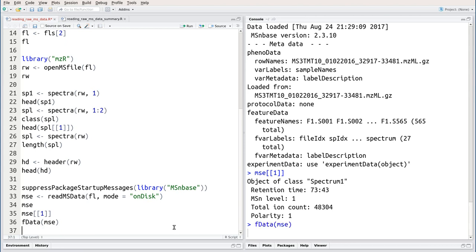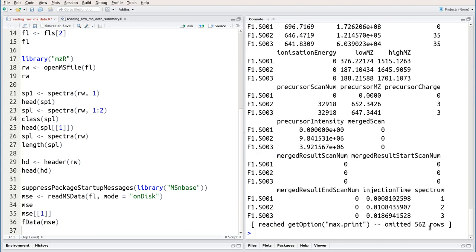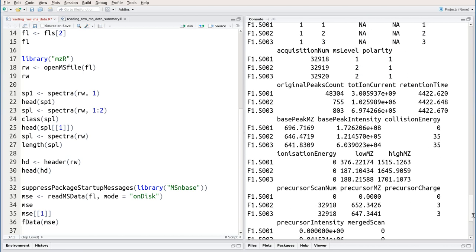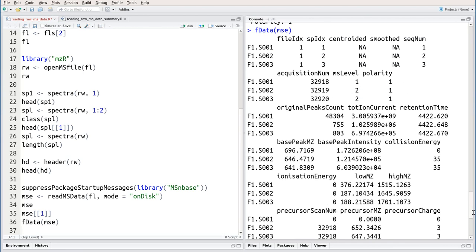We use the fdata function that returns a data frame containing pretty much the same information as we had before.